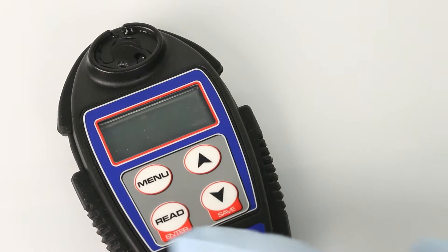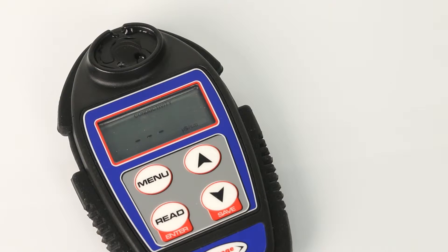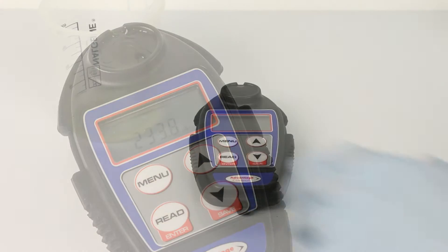Press Read Enter. The display shows dashes while reading. Discard this reading and refill the cup.